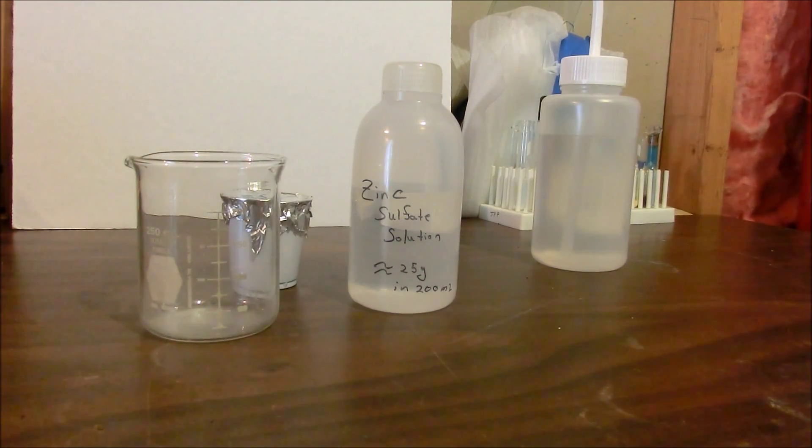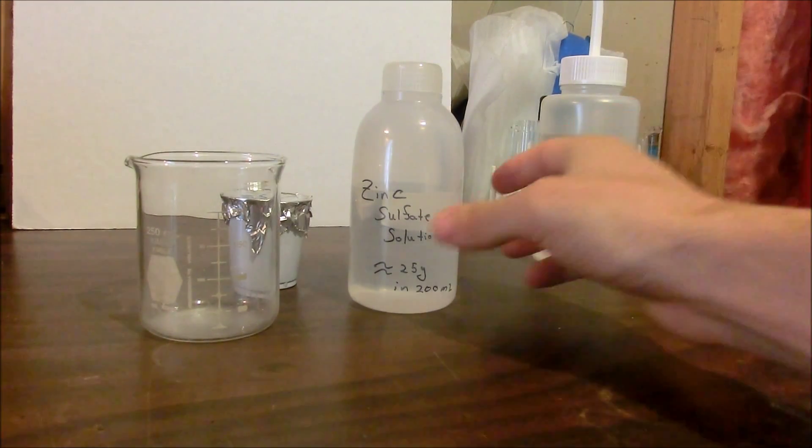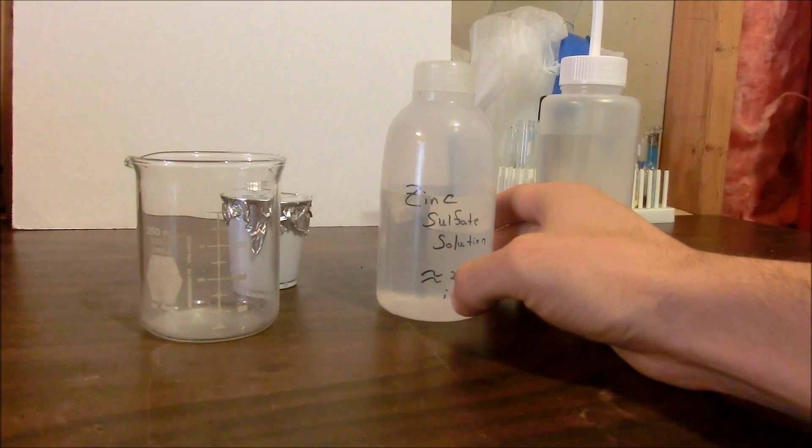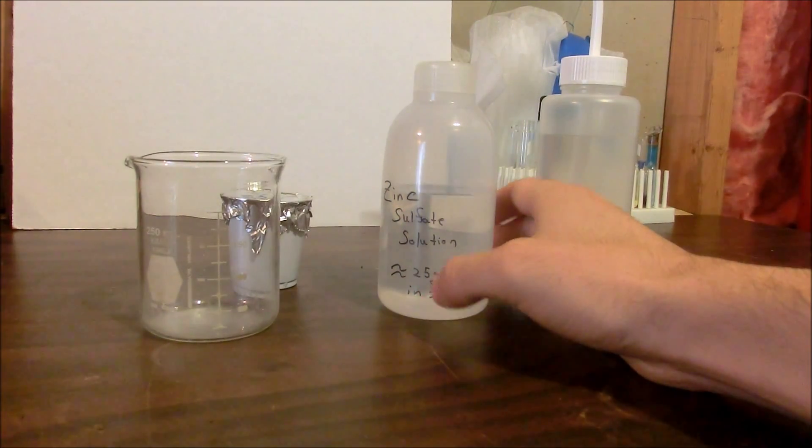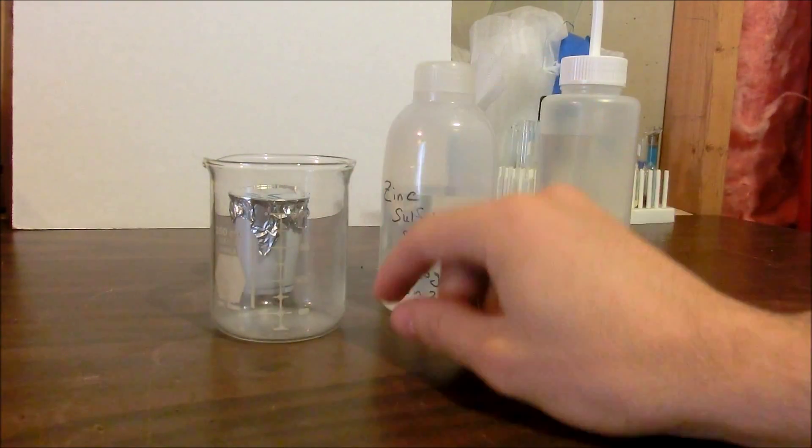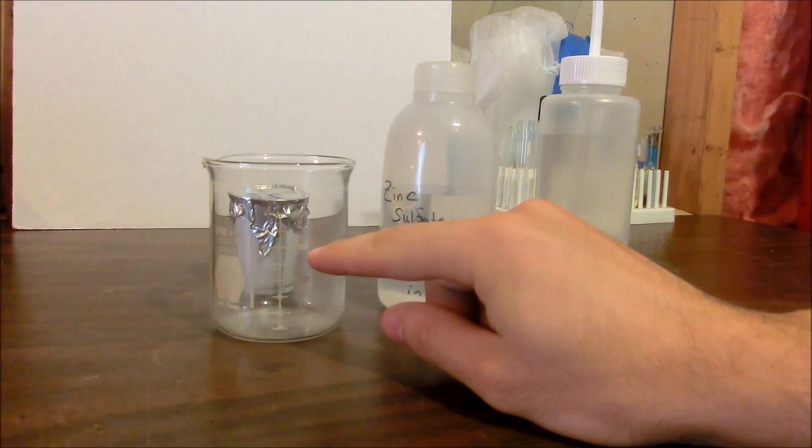The next step in our synthesis requires us to precipitate zinc sulfide from our zinc sulfate solution. So what I'm going to do is pour out about 100 milliliters of this sulfate solution to this beaker and then adjust the volume to 150 milliliters.